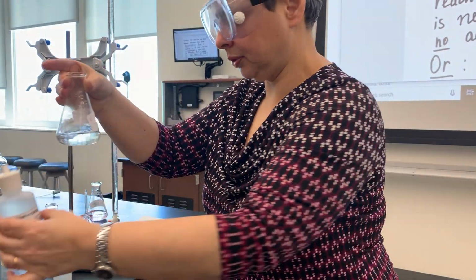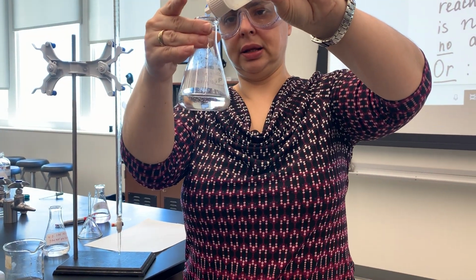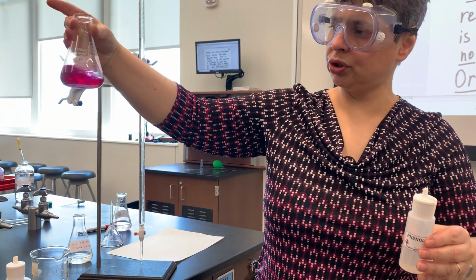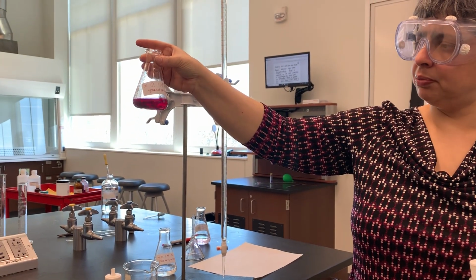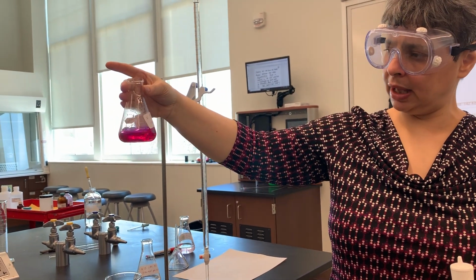I'm going to add a couple of drops of that, and now I'm going to add some phenolphthalein. As you can see, the solution turns a very dark pink color. This is the color of the solution containing base and phenolphthalein. So phenolphthalein turns pink in base.